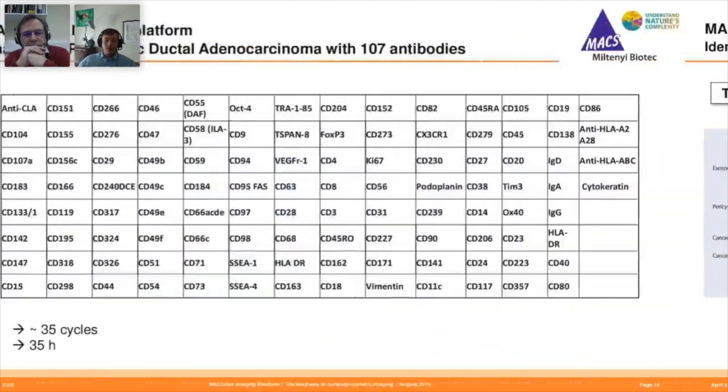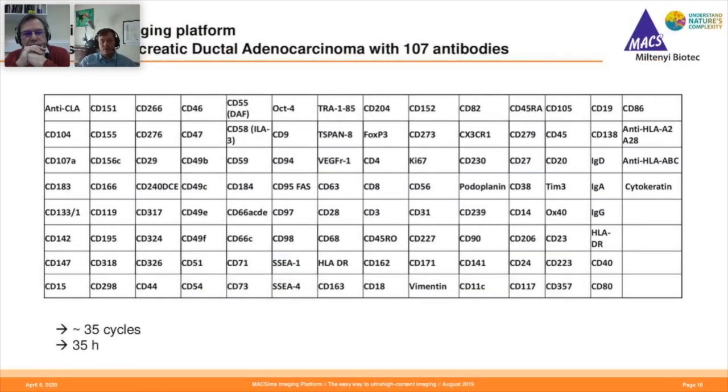Yeah, like I mentioned before, we use DAPI every single round for registration, but then we use different antibodies coupled usually to FITC, PE and APC to give you that data, and usually it's 3 per round. That's what we found is the best to avoid any optical crosstalk. Obviously, you can have just 1 per round if you're really concerned about that. More than 3? You can design it like that if you want to, but you're going to have to do a lot more careful planning of the fluorophores you use and which markers you consider, and all these sorts of things.